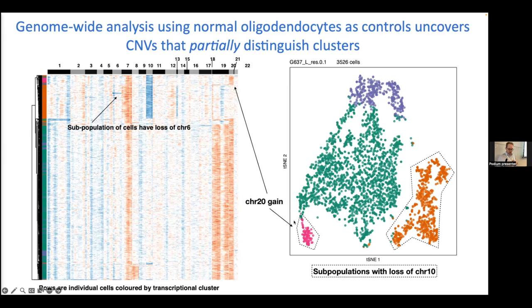And you can go down even lower. So this little tiny pink cluster is characterized by a gain of chromosome 20, and you can really go down the rabbit hole and start to pick out little subclones, basically until you run out of cells. But you can build these really beautiful phylogenetic trees of all the relationships purely using copy number data still derived from RNA. So even though it's a DNA feature, you can infer the DNA feature from RNA expression.